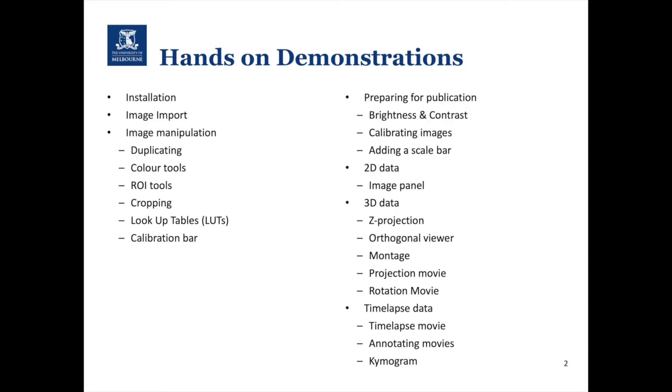In session 1 of the FIJI for Beginners workshop, we are going to cover installation of FIJI, how to import images into and also manipulate images within FIJI. This includes duplicating, splitting and merging colors, using region of interest tools, and cropping images in preparation for figures.